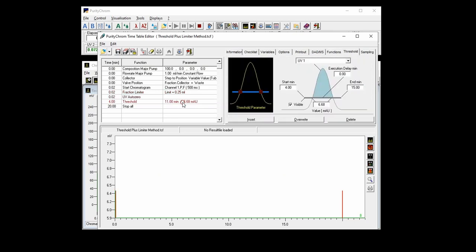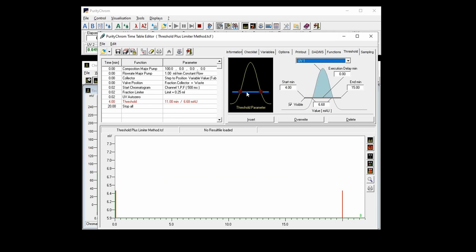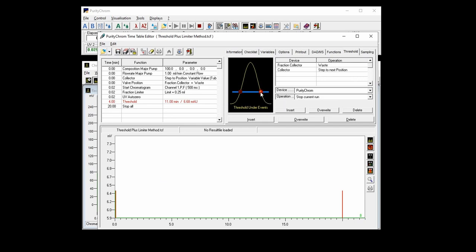The threshold you can set in the threshold tab here. And here you put in when you want to start surveilling the peaks via a threshold and where you want to end doing this. And also you can set the UV value and the data channel you want to use. You can use any data channel that you are recording. And the important thing is that you define what the software should do upon exceeding the threshold. And here I put in fraction collectors going to fraction. And what the software should do when going below the threshold limit. And here I set the fraction collector going to waste and then the collector should step to the next position so that when starting fractionation again it will use a clean vial for fractionation.